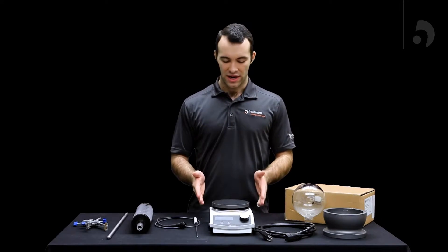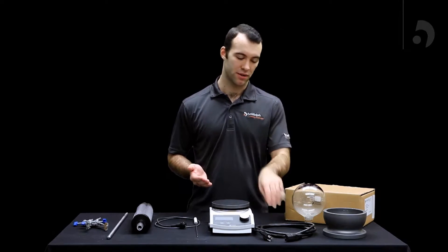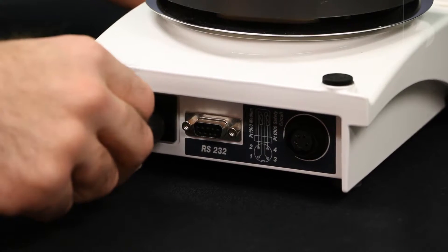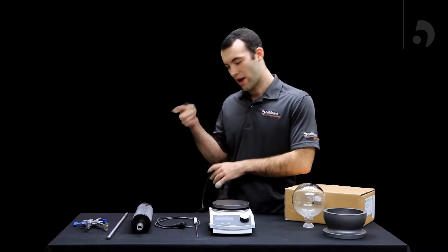Once you've gotten your HiConnect out of the box, the first thing you're going to want to do to start assembling it is to plug in the power cord. That goes in the back and then into an outlet.